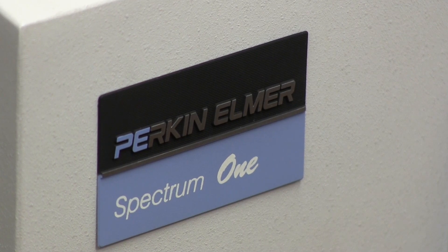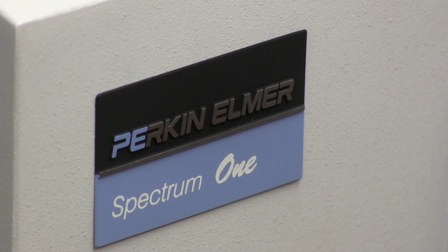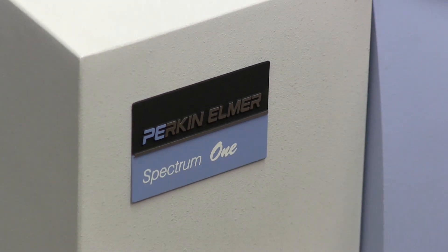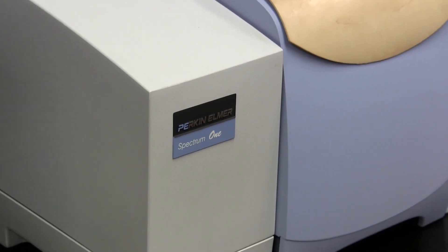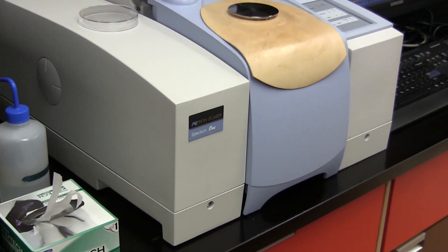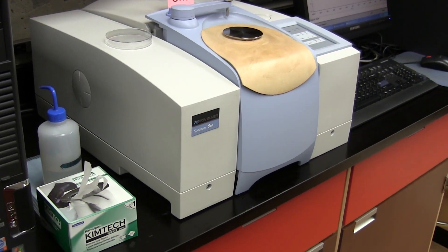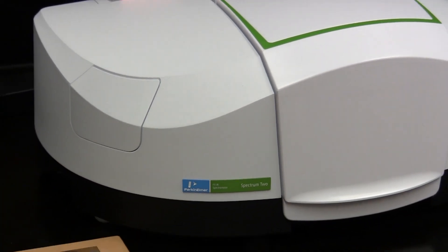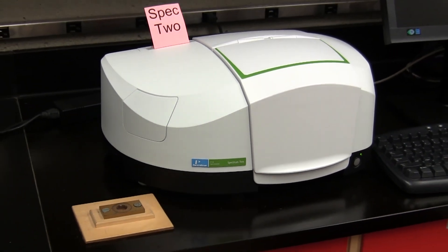The Chemistry Department owns two Fourier transform IR spectrometers, often just called FTIR. The first is a Perkin-Elmer Spectrum 1 FTIR, which we refer to as SPEC 1, and the other is a Perkin-Elmer Spectrum 2 FTIR, which we refer to as SPEC 2.